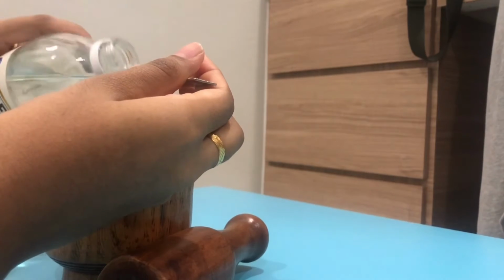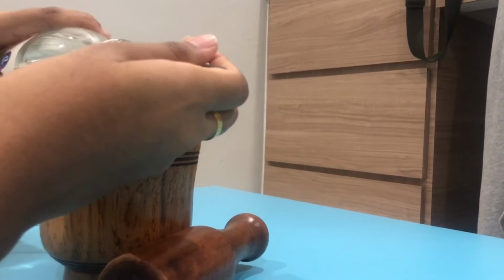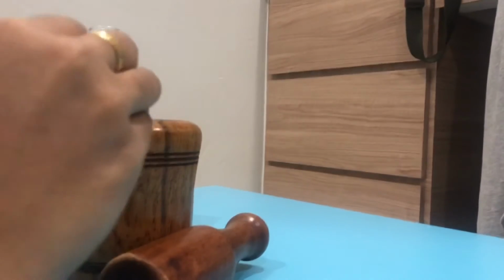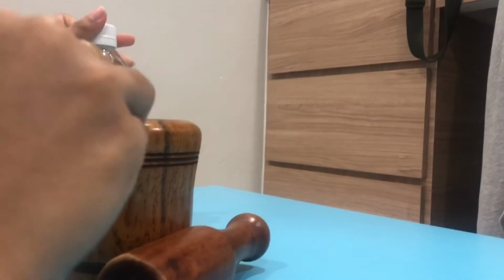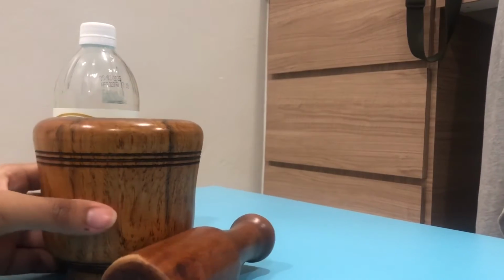So 5 ml in, 10 ml in. Okay, so now I'll just put this away, and I will begin to crush the sample.